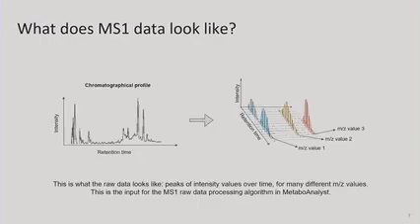structure. Based on the MS1 data generation process, we can get a general chromatography profile. As you can see, this is the total ion chromatogram of the MS data. In this data, according to the retention time, the different ions have been eluted from the liquid chromatography, and different intensities are detected.